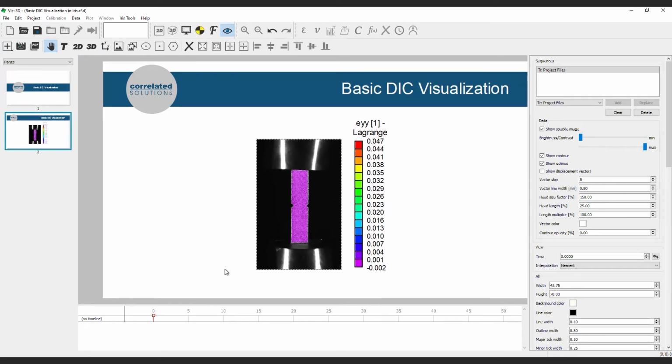Notice there are no options in the timeline below. This is because no time coordinates have been set. Find the Time option and using the drop-down, choose Forward 10. This automatically places start and stop keyframes on the timeline 10 seconds apart.